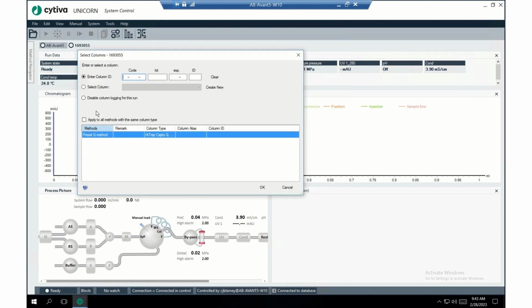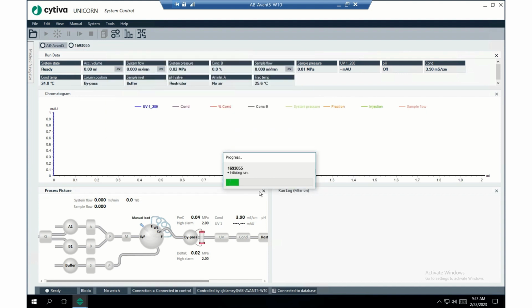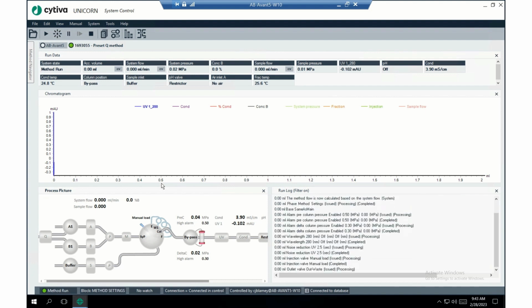And then this window comes up if you're going to log the number of uses for your column. So there's a 2D barcode on some of the columns, and there's also stickers that come with the Avant. We're just going to ignore this because we're not going to log the number of uses with our column. Hit OK, and the method will start running.